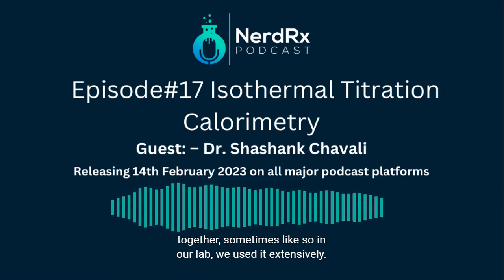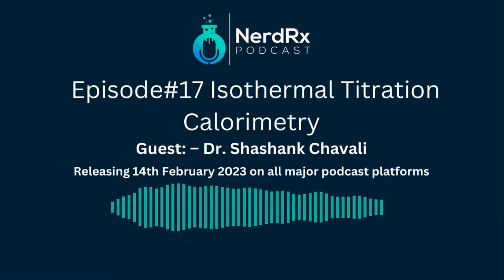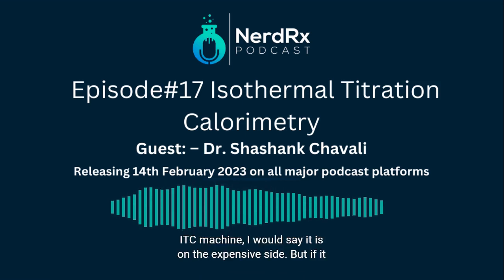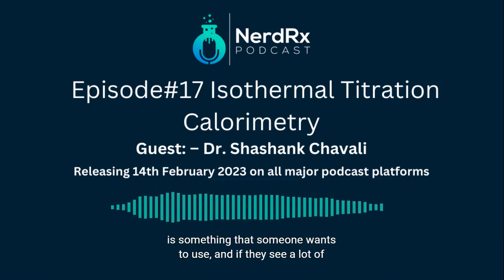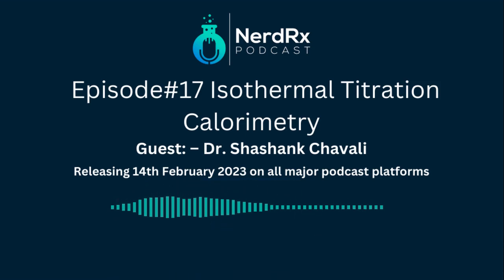In our lab we used it extensively. In Rochester, when our PI got a grant, we had our own ITC machine. I would say it is on the expensive side, but if someone wants to use it and sees a lot of application for it, then it's a great investment.